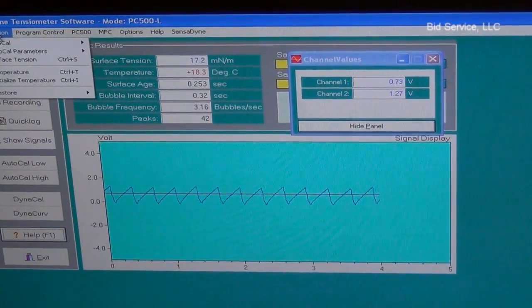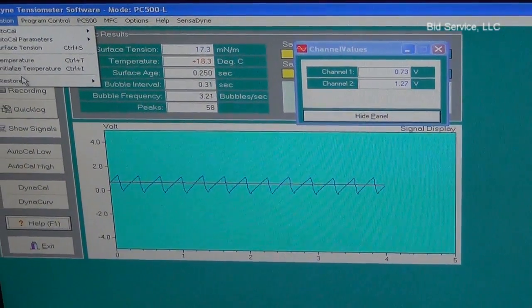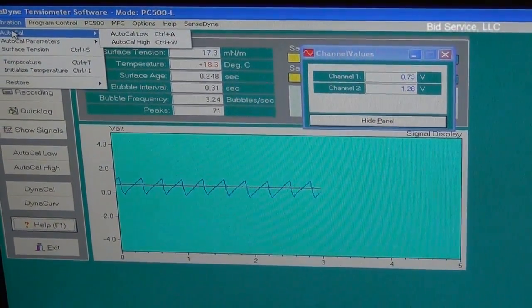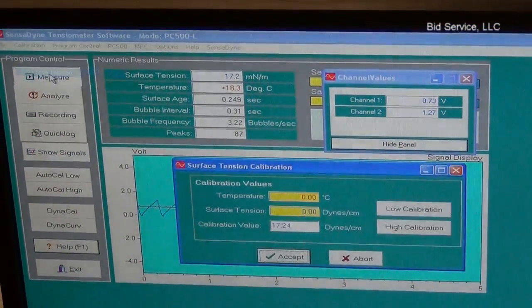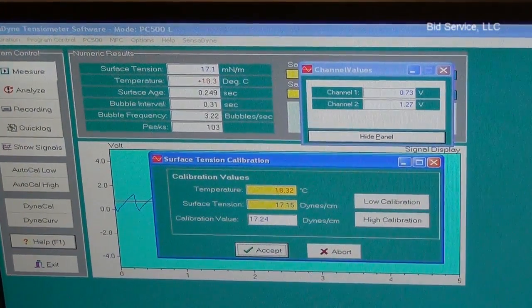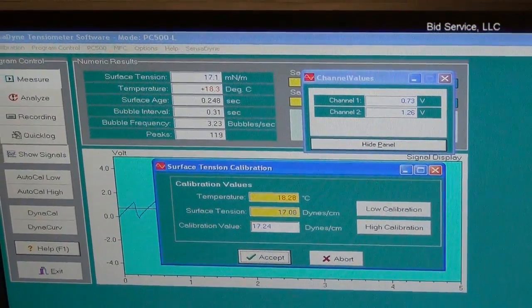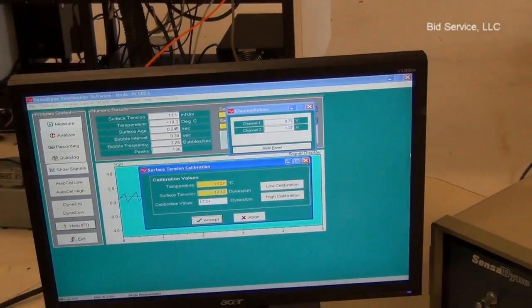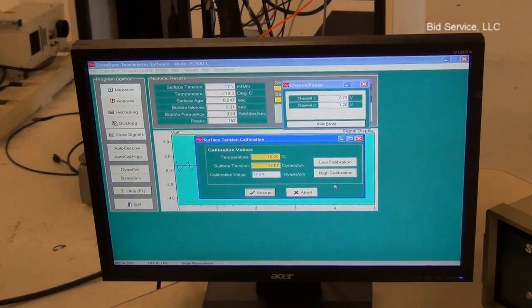There is a calibration routine that's explained in the manual. Any time any changes are made — either the bubble frequency or the zero and span of the wave — you need to recalibrate. The low being the alcohol and the high being the water.